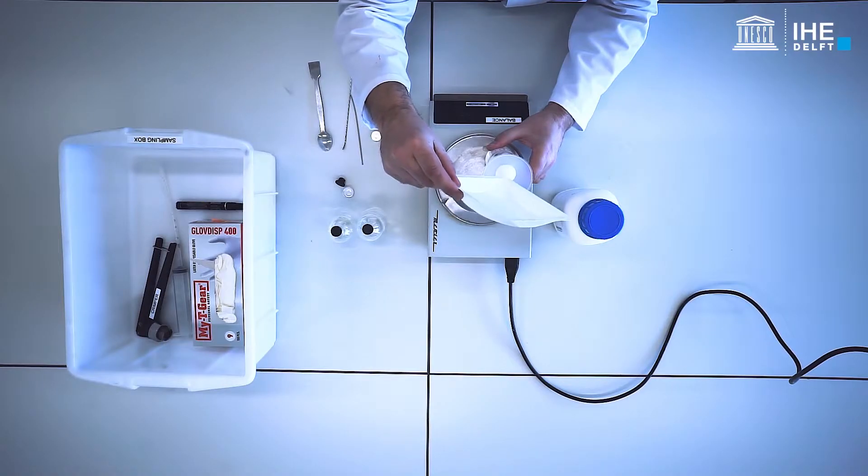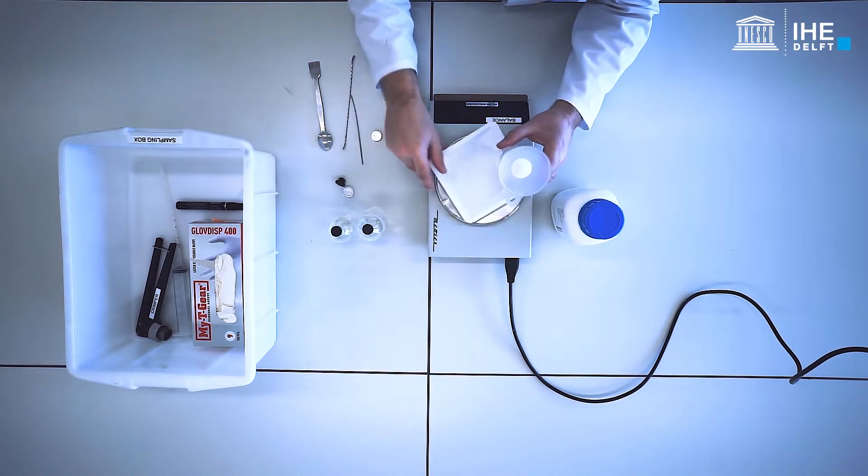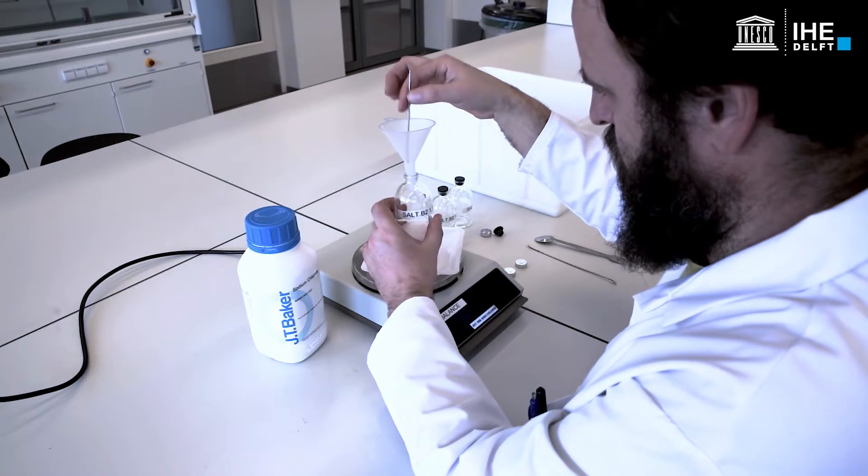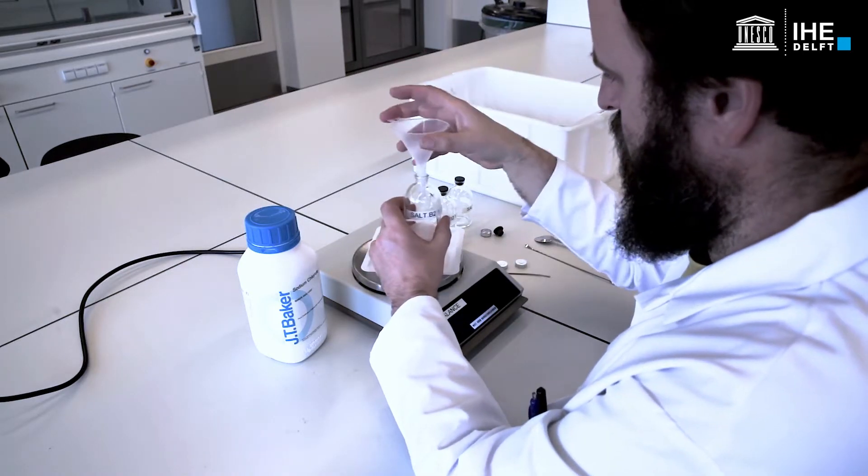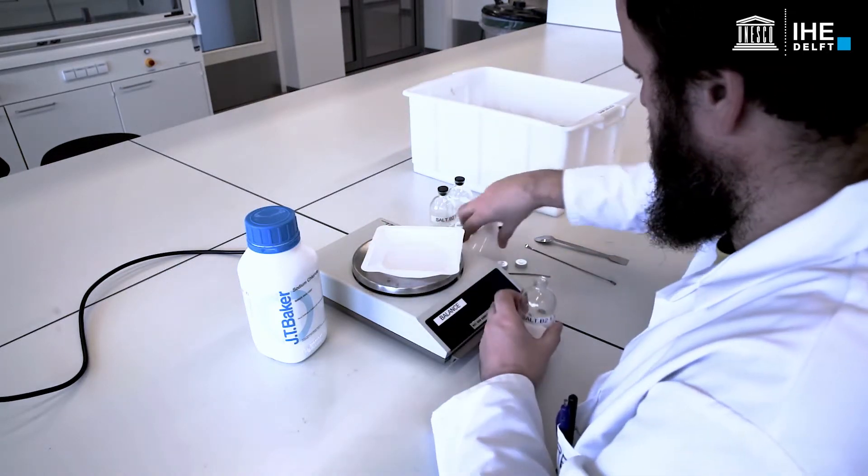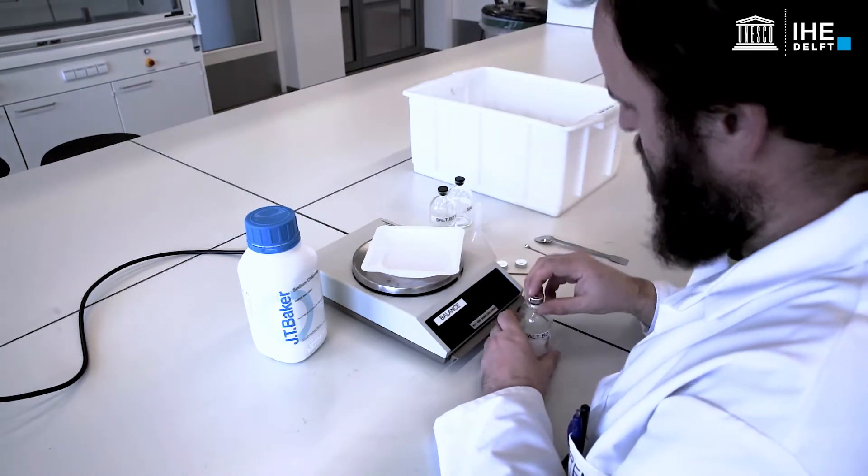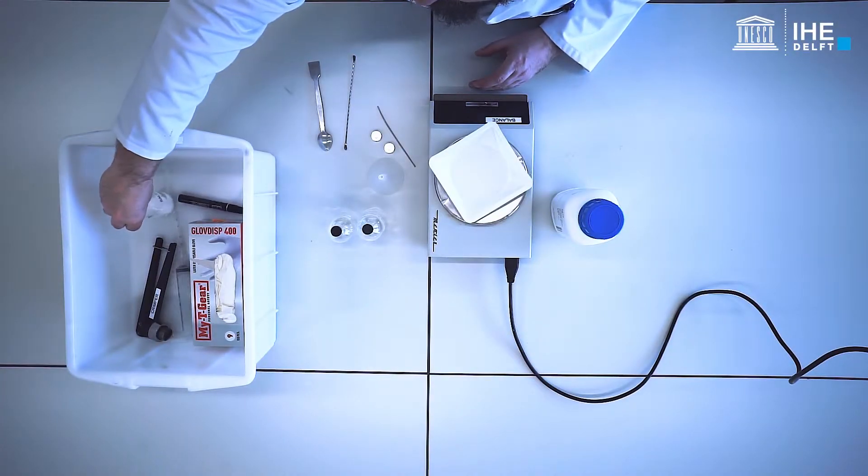Prepare the required number of serum bottles depending on the number of samples to collect and bearing in mind that the analyses should be carried out in triplicate. Once the salt has been poured in, put the rubber stopper and the lid on the bottles without closing them and leave them ready with the rest of the materials for the in-situ collection of samples.